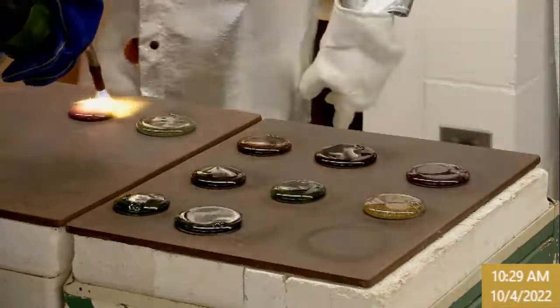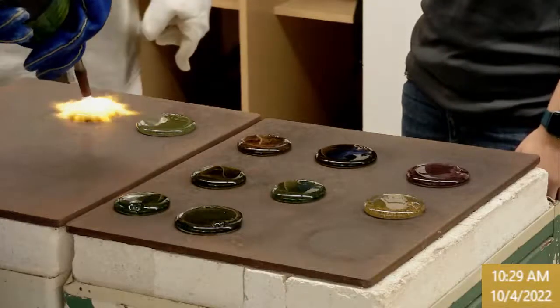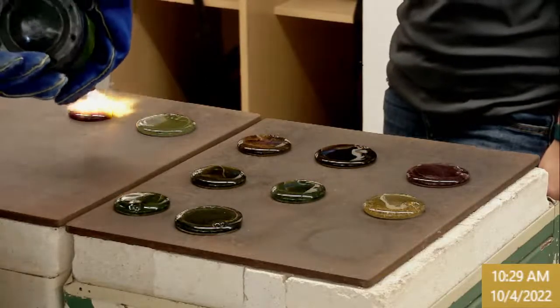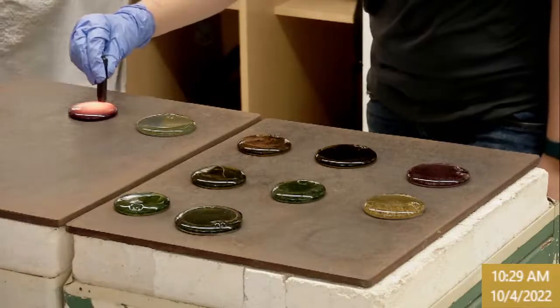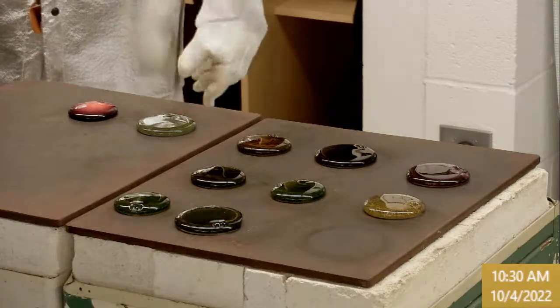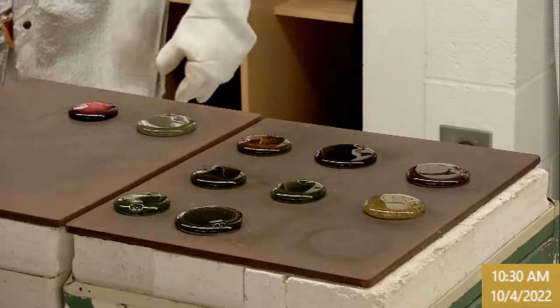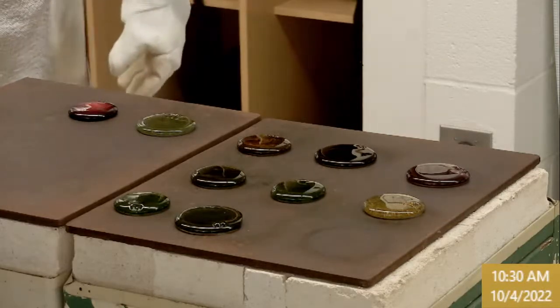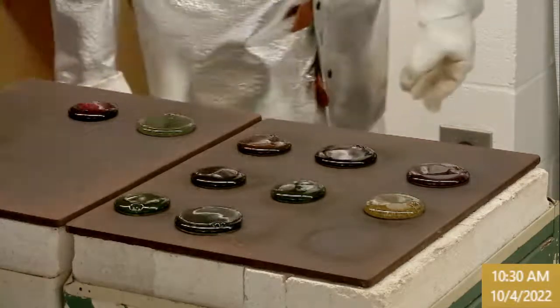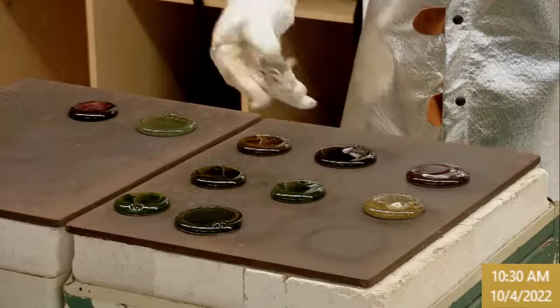Yeah, work on that as much as you can to pull it down in. All right. I think that's a goner. Whenever you see that degree of chunkiness, that focuses force onto those regions where it's inconsistently melted batch. I'm not sure what is doing it, but that one's under a lot of pressure.